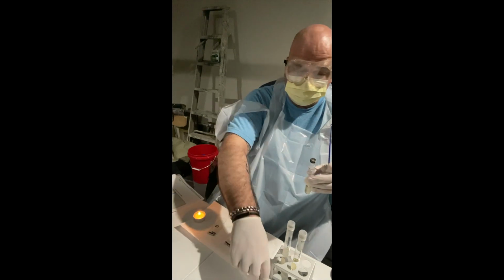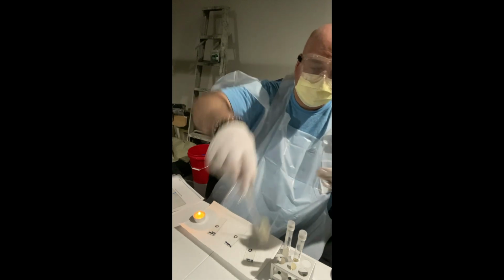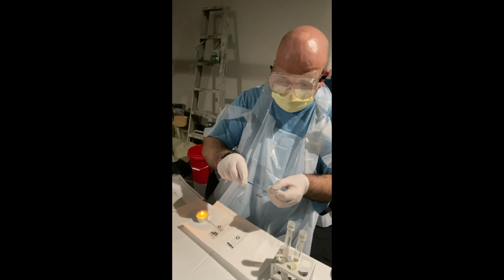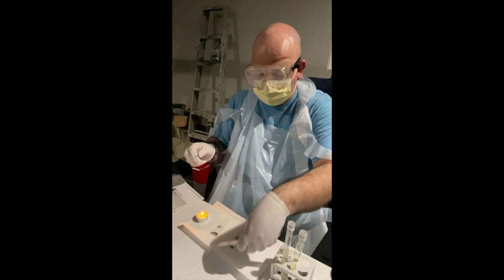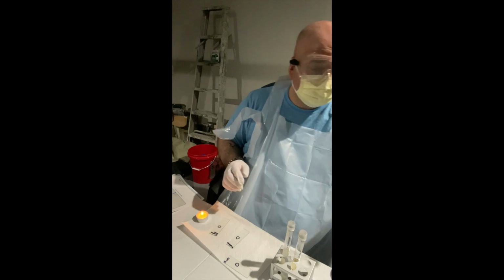Okay, so that's that. Lid's going back on, and then I'm going to set the E. coli tube to the side. So this is my E. coli slide. I'm going to press the loop just right in that circle I drew. And then just a couple of times. Make sure. Okay, now this is going to be set aside to dry just right here, and then off camera I do have some bleach where I'm going to soak this before I bring it away.